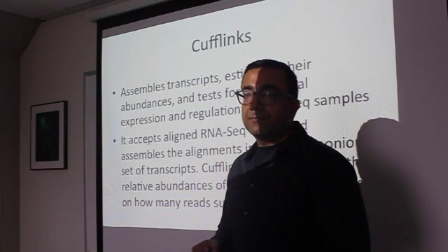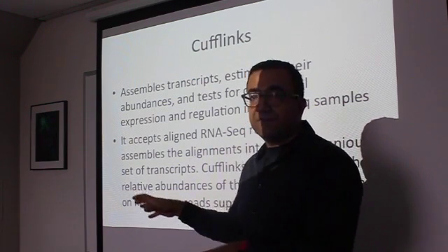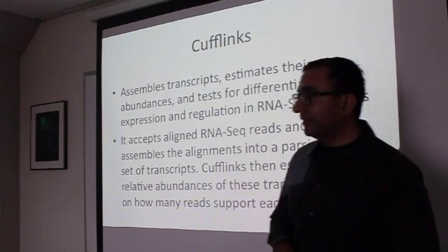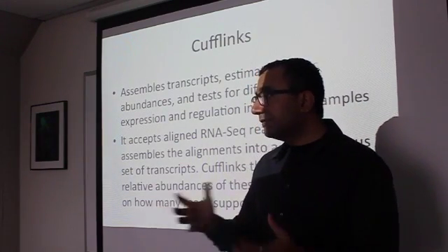On balance, Cufflinks will give you fewer differentially expressed genes. Cuffdiff, yes. The Cufflinks, Cuffdiff combination gives not fewer, but different results. So it's just a statistical engine that's different behind the programs. Right. So the results do not match up.